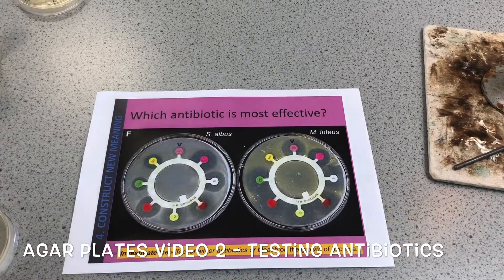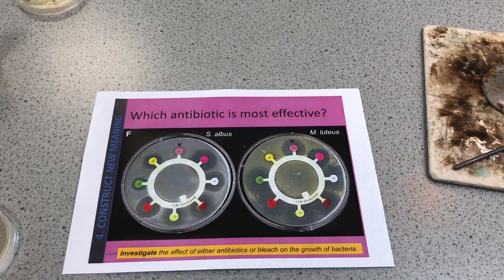This is the second video in a line of three videos looking at the agar plates required practical. It's a triple science practical looking at aseptic technique, also called sterile technique. It's a way of growing bacteria and then using them in a variety of different ways to either identify the bacteria or identify different treatments for that bacteria.